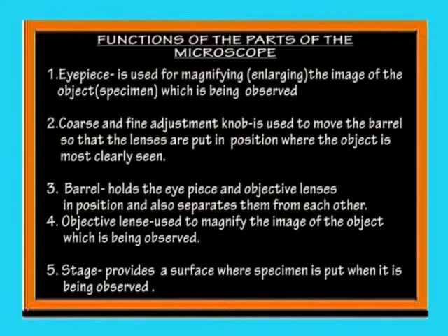Okay? So let us look at the stage. What is the function of a stage? Stage provides a surface where the specimen is put when it is being observed.